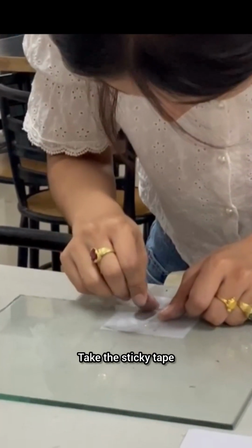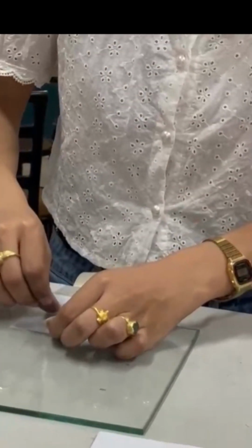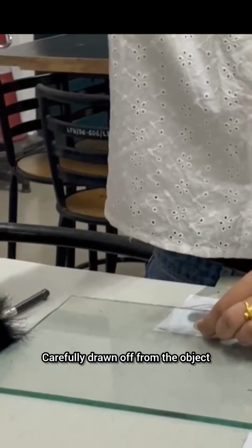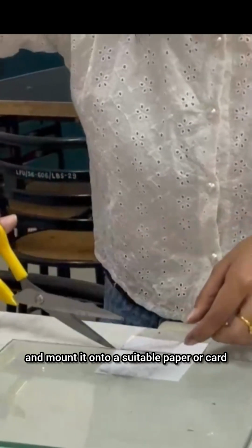Take the sticky tape and put it on the developed fingerprint. Make sure it is fully stretched. No air should be trapped in it. Uniformly press over the developed print, carefully draw it off from the object, and mount it onto a suitable paper or card.